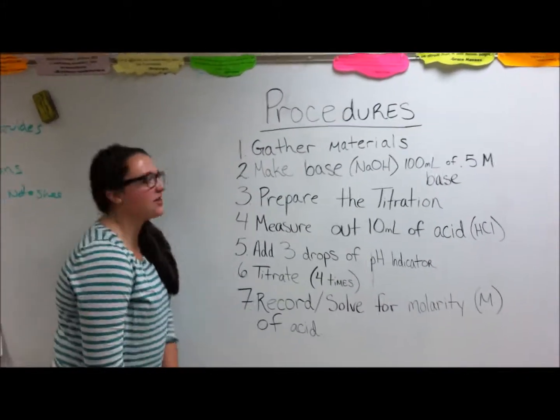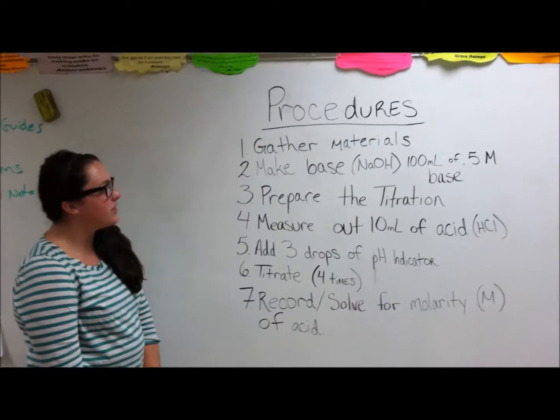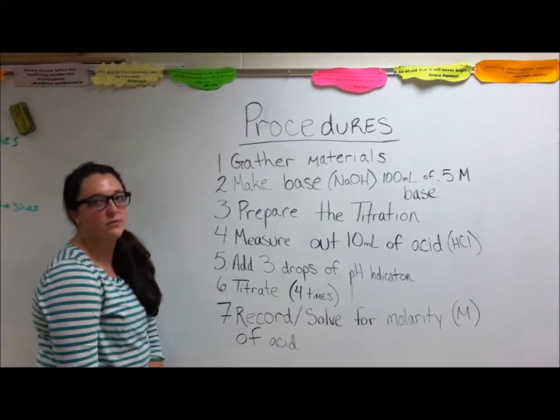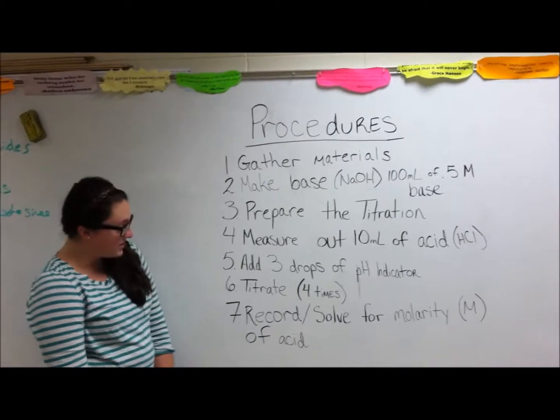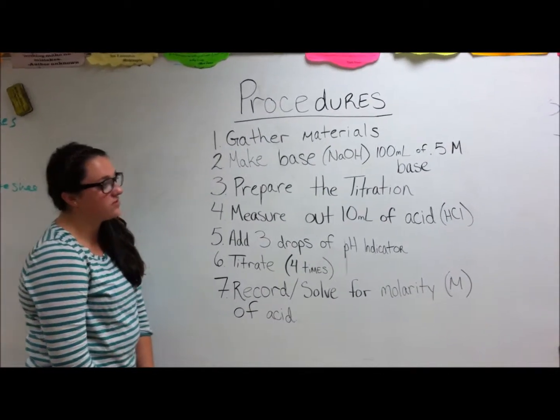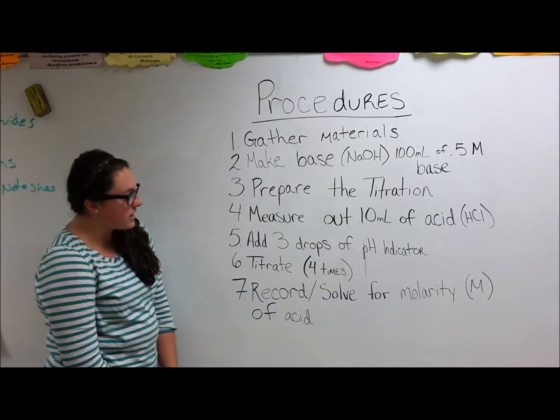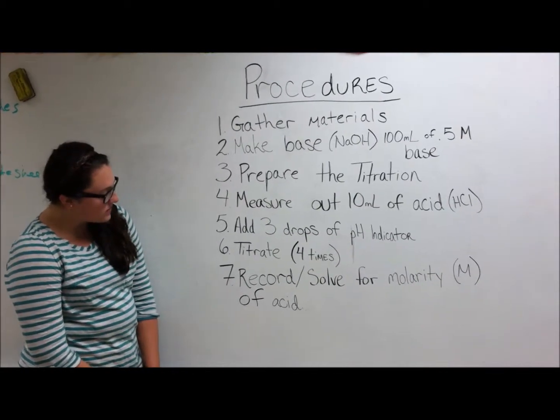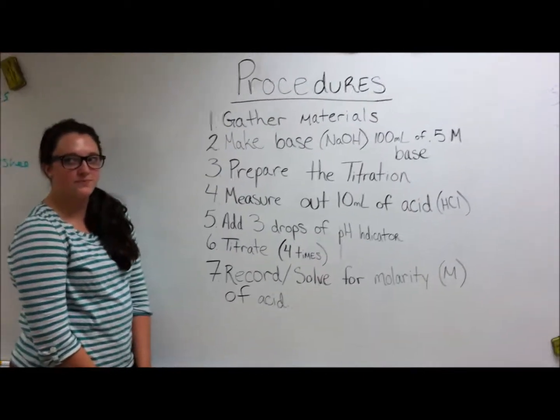So for our procedure, first of all you're going to gather your materials, and second you're going to make the base, which is NaOH, and it's going to be 100 milliliters of 0.5 molar base. And third step is to prepare the titration. Number 4, you're going to measure out the 10 milliliters of acid, which is the HCl. In step 5, you're going to add 3 drops of pH indicator. Number 6, you're going to titrate 4 times. And number 7, you're going to record and solve for molarity M of acid.